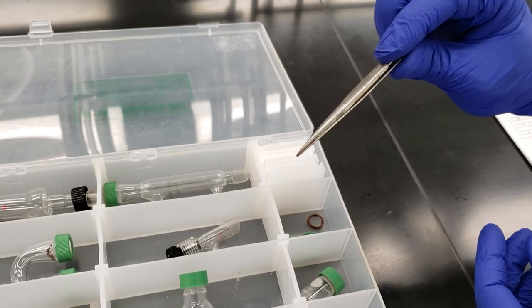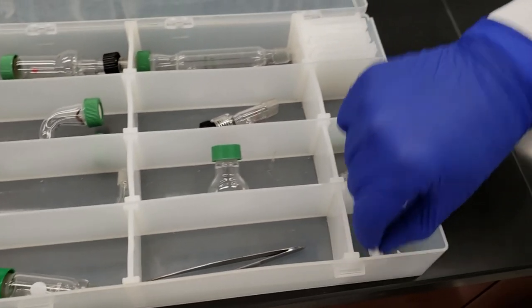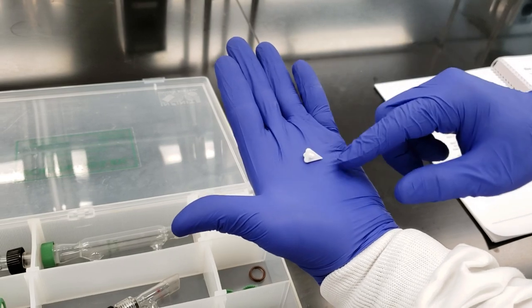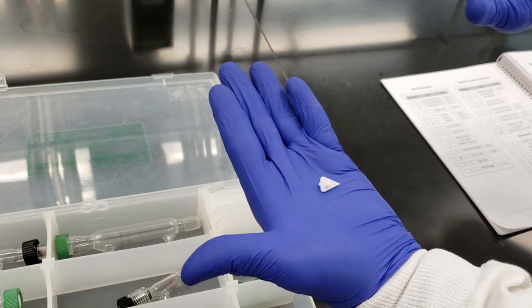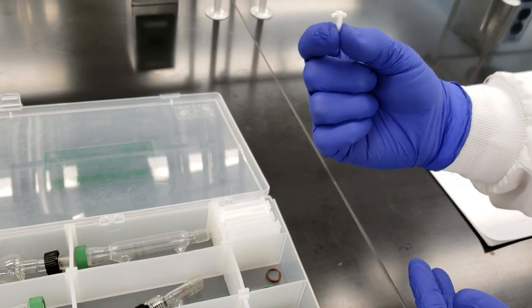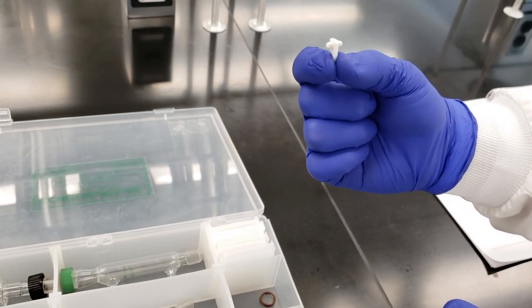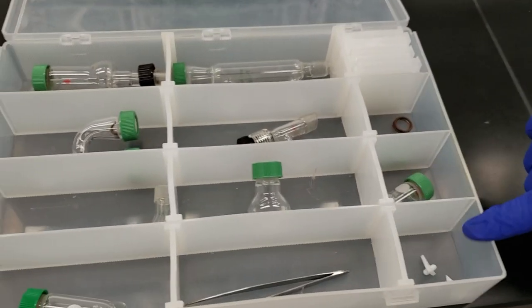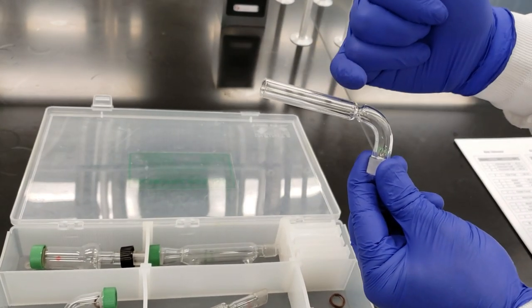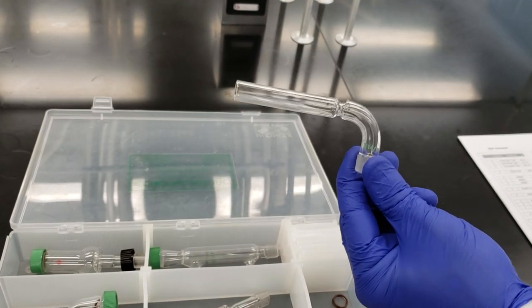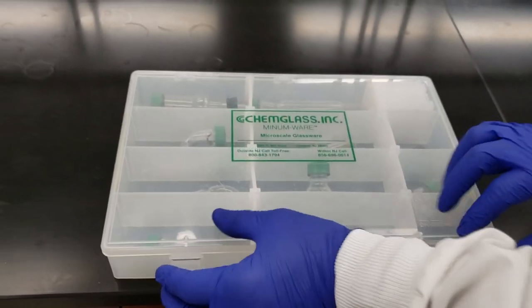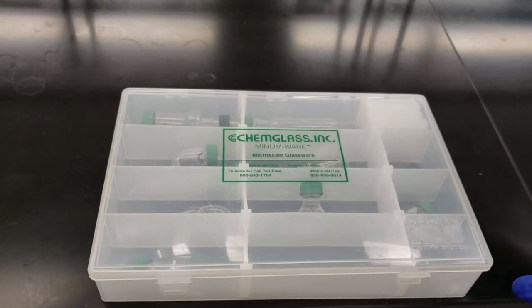We have tweezers or forceps. We have two spin vanes, magnetic spin vanes that you put into a reaction vessel. Set them on a stirring plate or hot plate and they'll stir the solution automatically. These are invaluable but very tiny and tend to go missing, so pay attention to where you put them. Last is our drying tube, which we can pack with cotton and a drying agent to keep moisture out of reactions if necessary. That's all the glassware in your lab station.